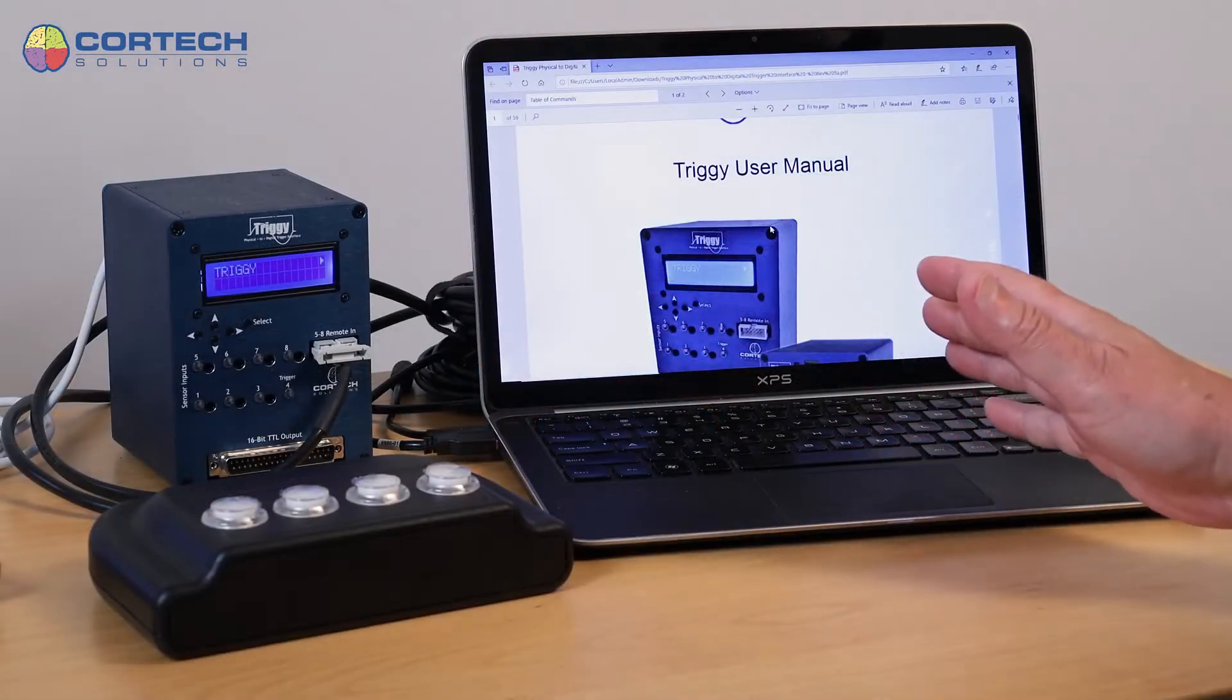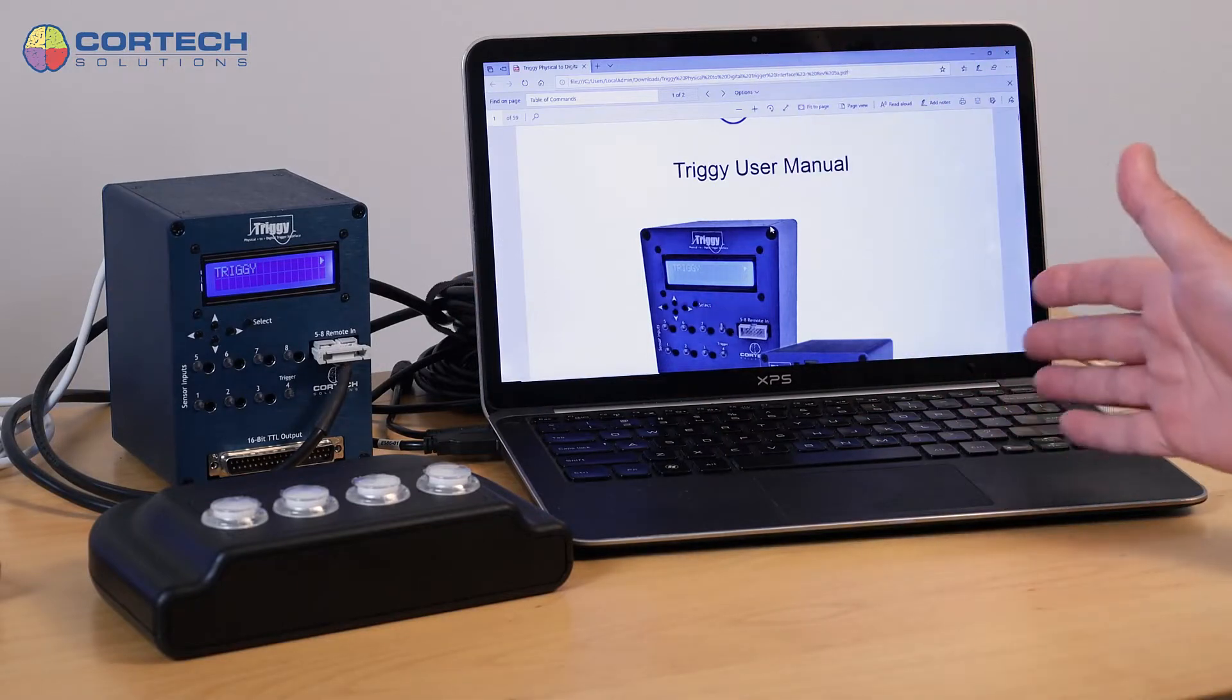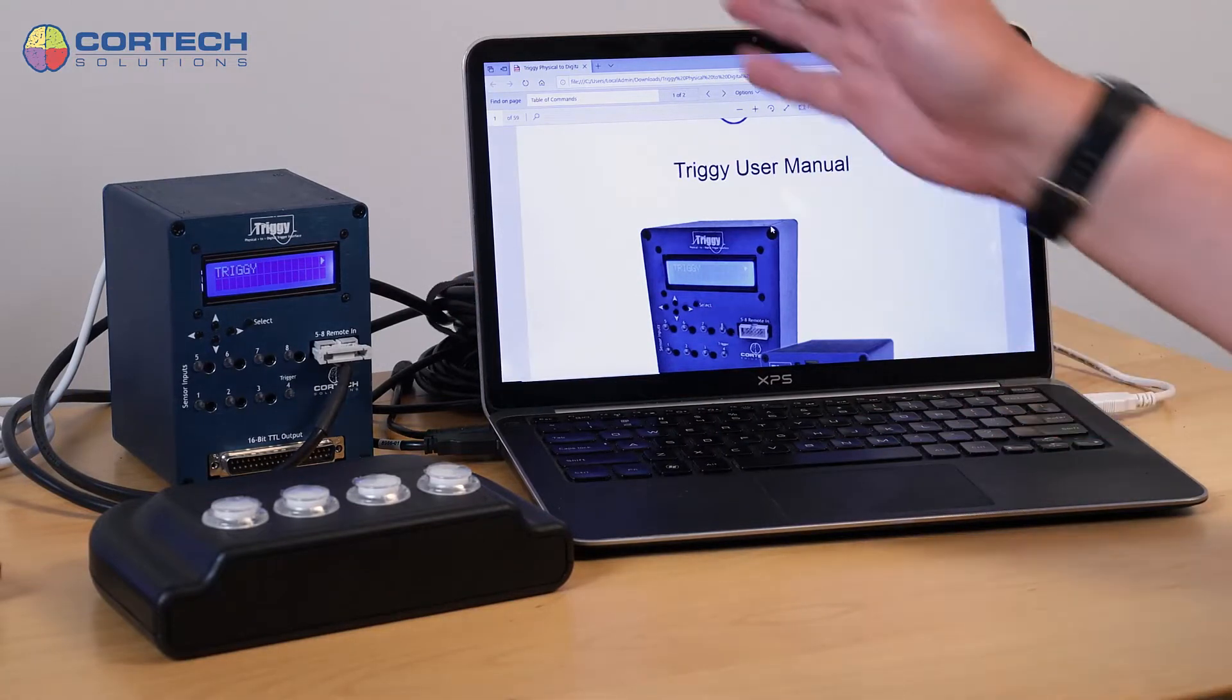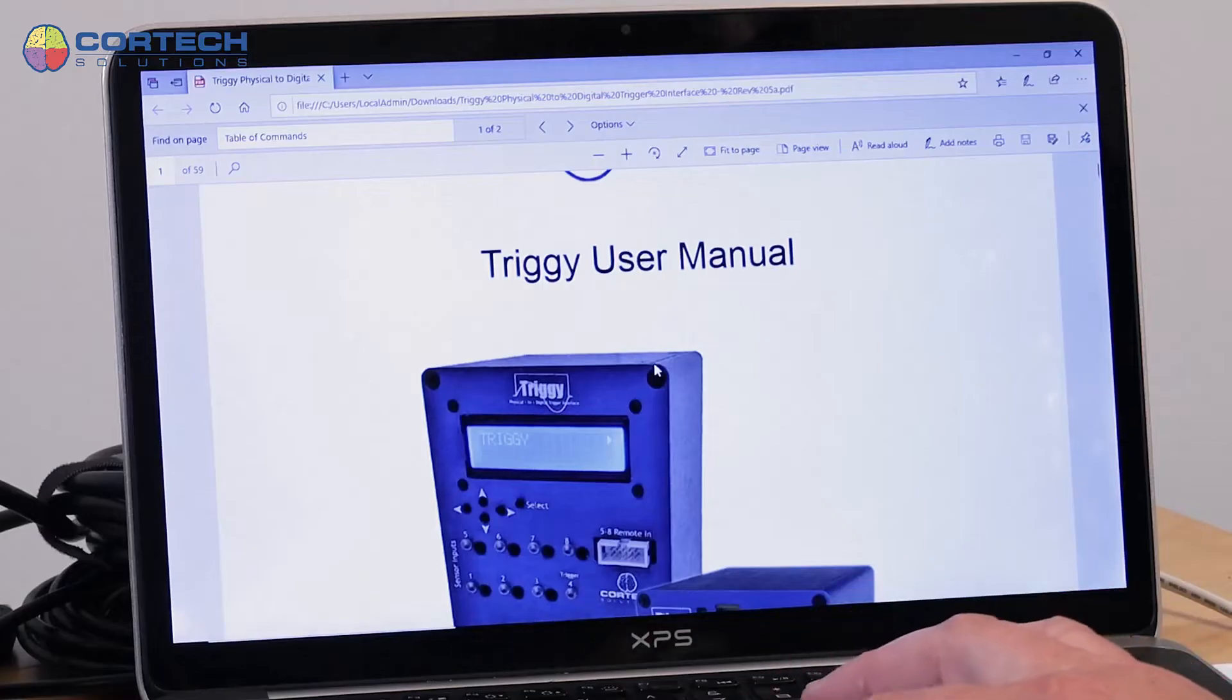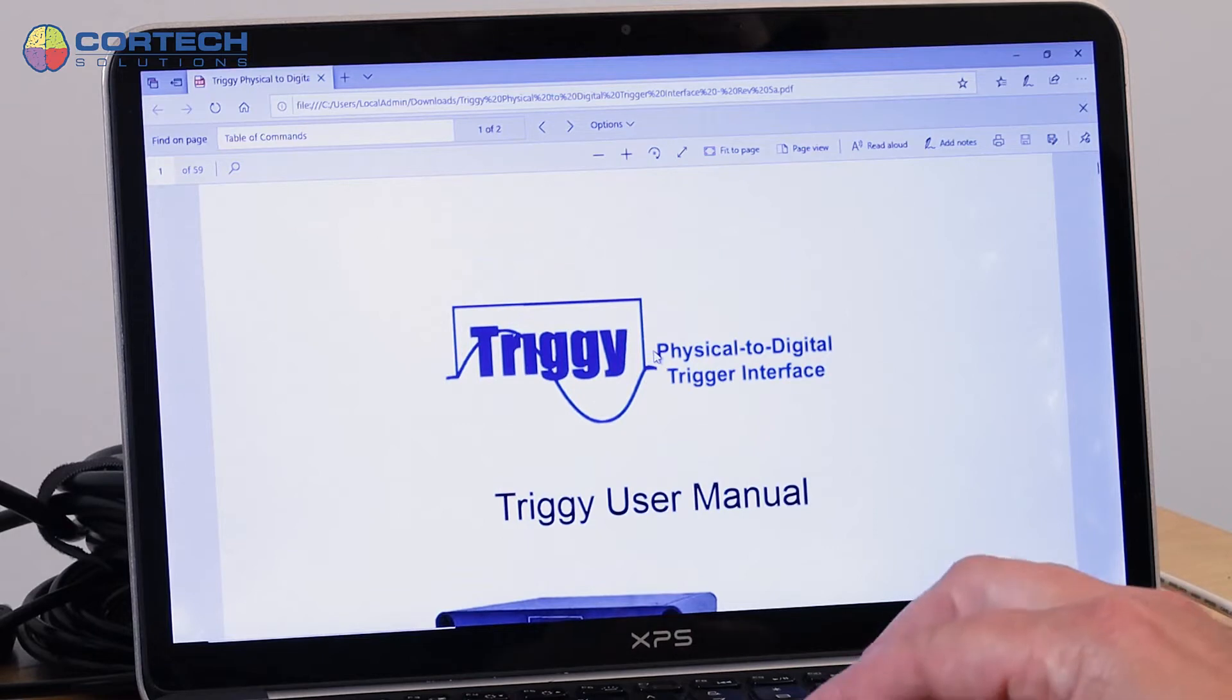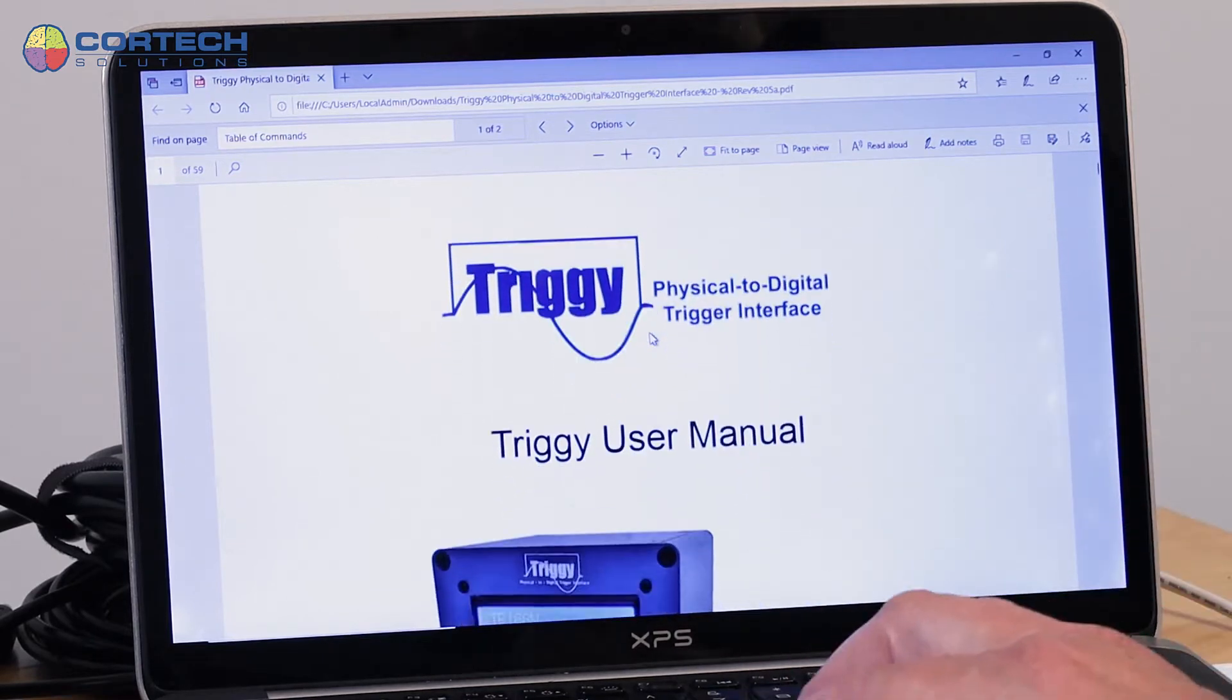To demonstrate how this command pathway between the serial port on your experimental control computer and the Triggy device works, I'm just going to show you in the user manual first where to find the information.